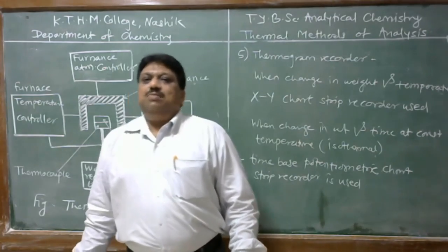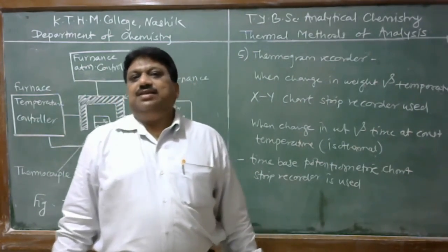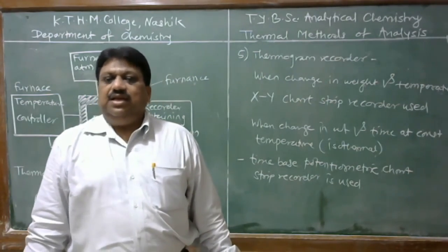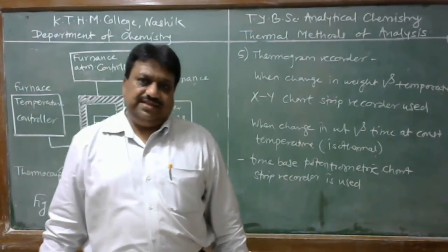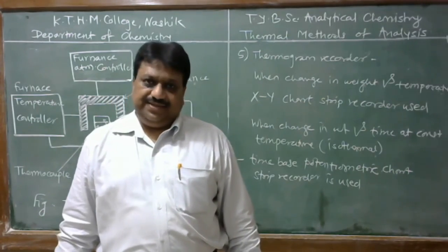Student, this is all about the instrumentation of thermobalance. Thermobalance is the apparatus used in thermogravimetric analysis. In the next lecture, we discuss how thermogravimetric analysis is carried out and the results obtained in thermogravimetric analysis.